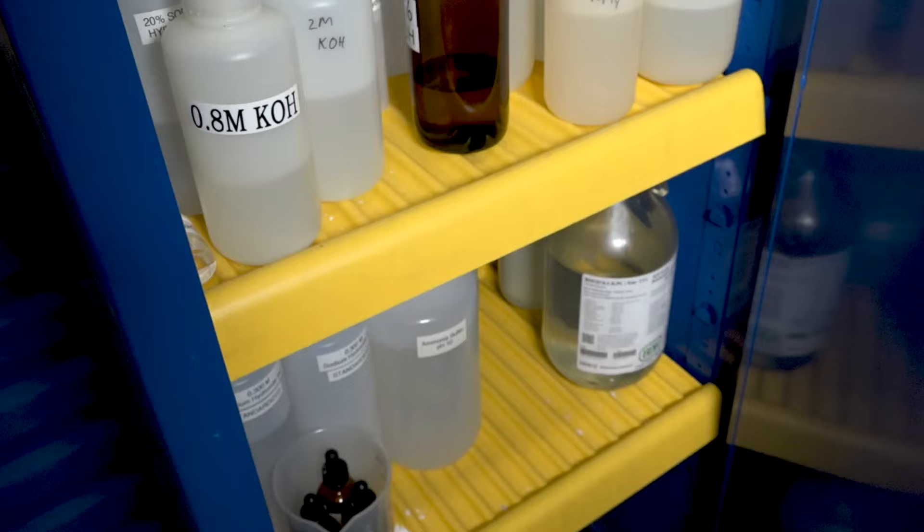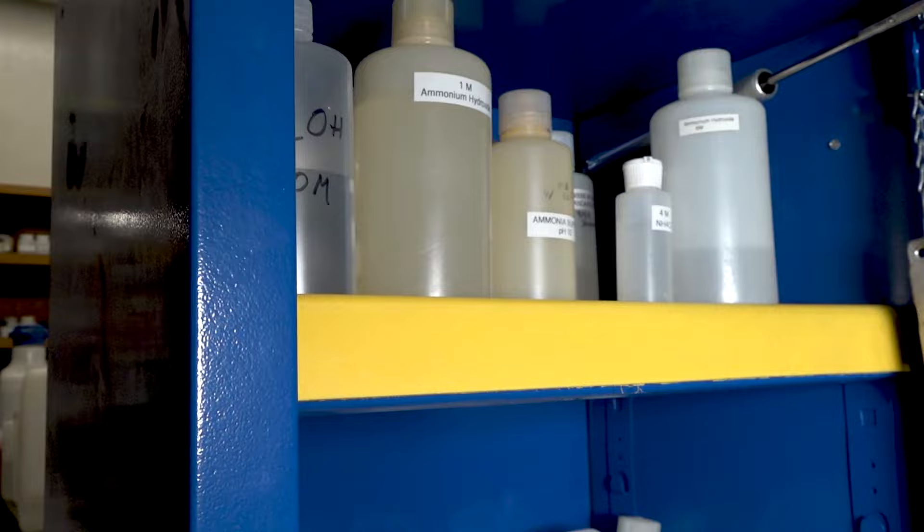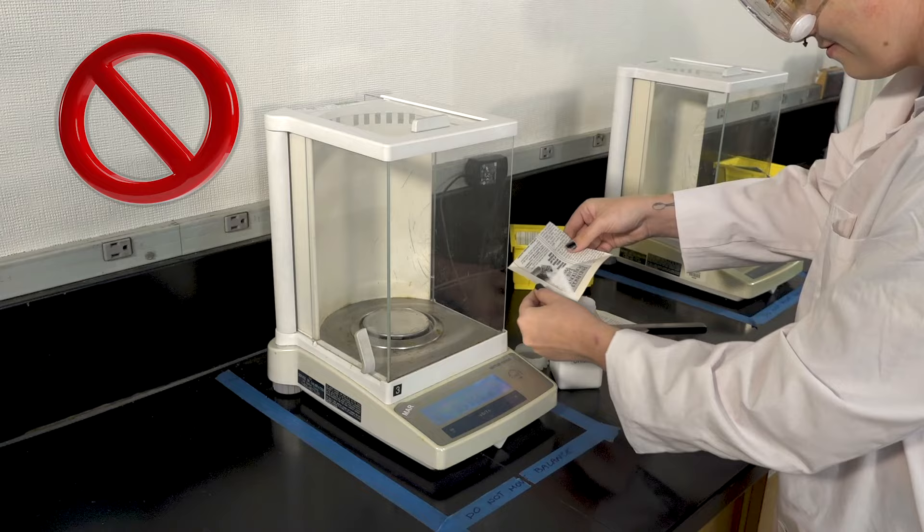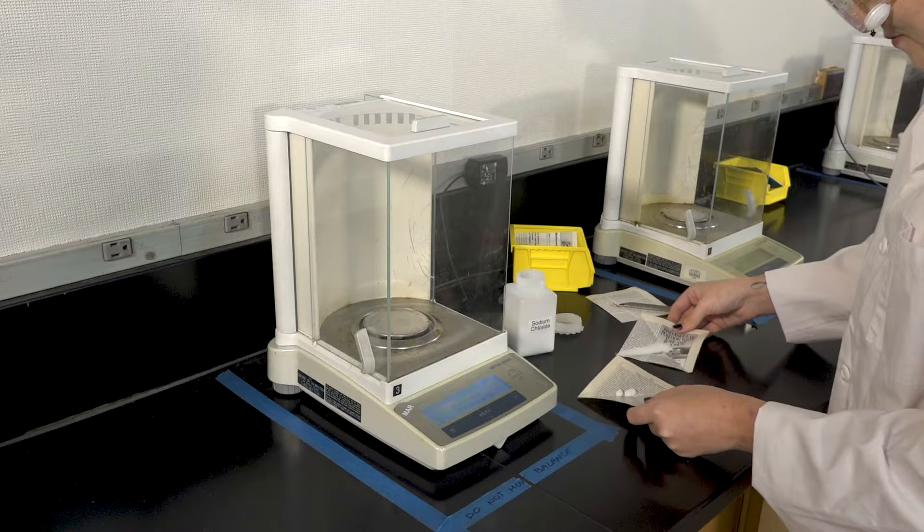The bottles of given chemicals provided by the Fresno City College Stock Room are referred to as stock bottles. You can take material out of a stock bottle, but never return anything back to the stock bottle. You run the risk of contaminating the entire bottle. If you accidentally remove too much, simply transfer the excess to another piece of weigh paper. You can give your excess to a friend in need or dispose of in the proper waste container.